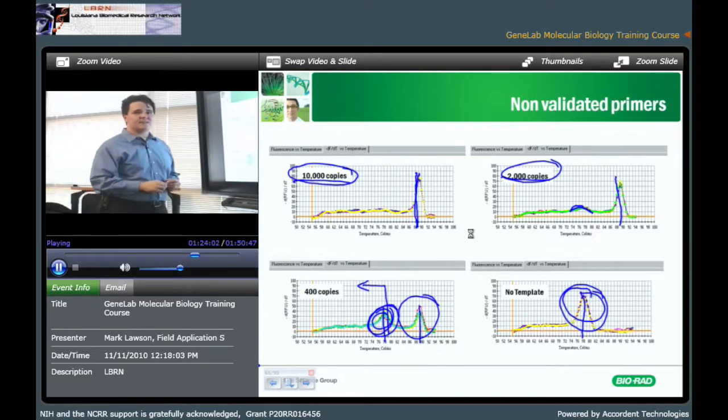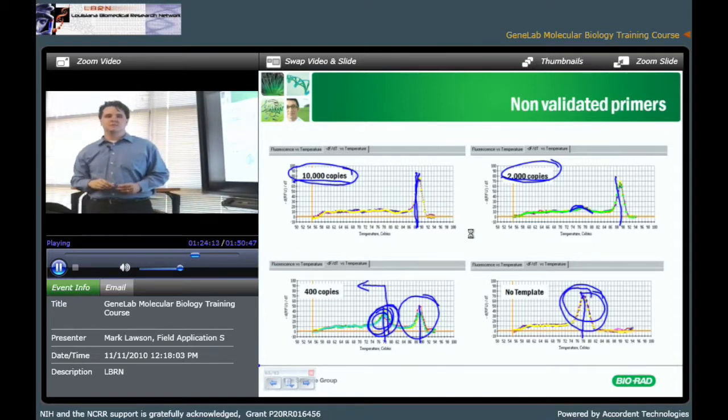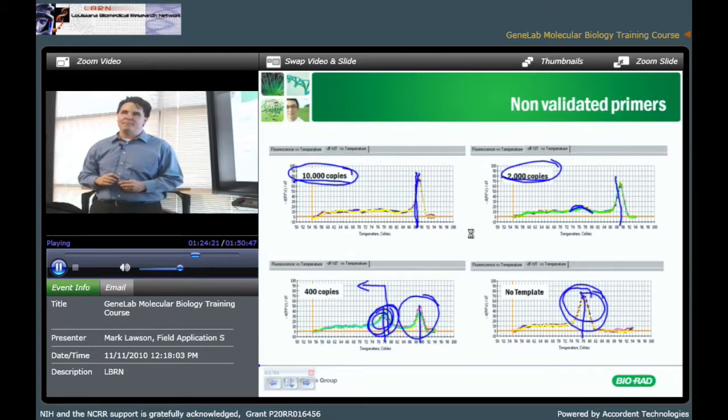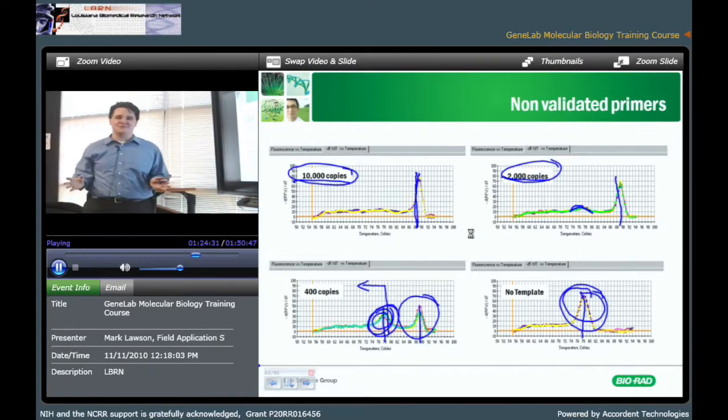But it's interesting that the primer dimer isn't a problem in the 2,000 copy. And primer dimer isn't a problem at 10,000 copies. This is what I call the teenager effect. In my observation, a bored teenager is the most destructive force in the universe. Right? If they have nothing to do, no matter whether they're good or bad teenagers, they will eventually get into trouble.